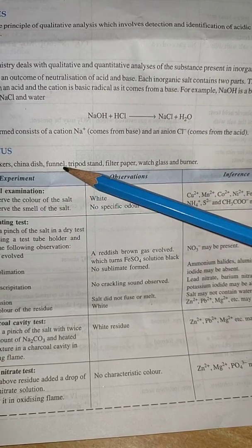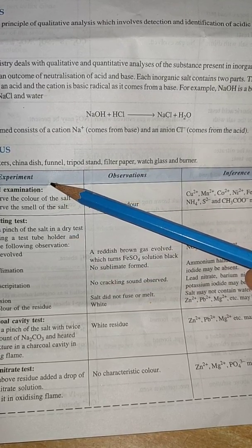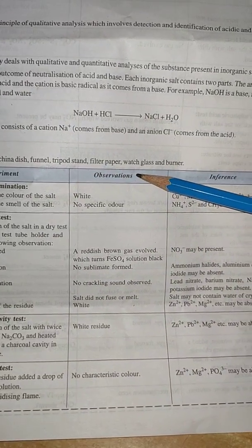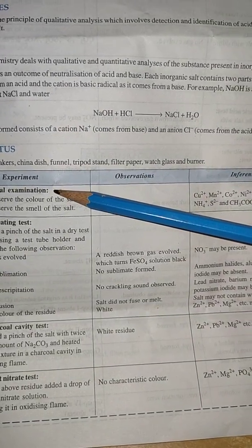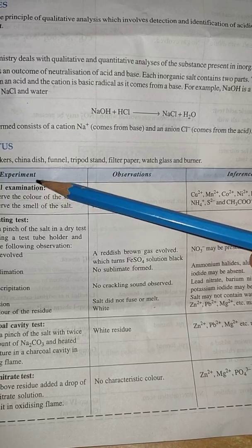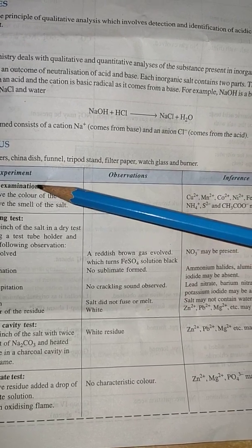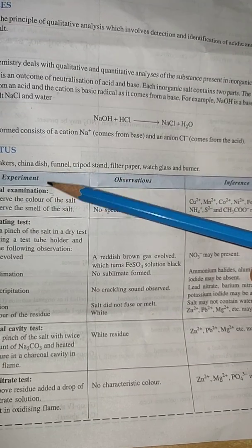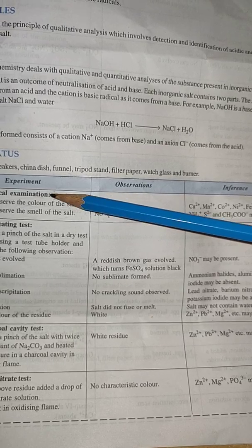Now at the end of the lab manual there are certain columns made: the first column is experiment, then observation, then inference. In the first column you will write physical examination. This is the first stage how you can detect or guess what kind of acidic radical and basic radical are present in the given salt.